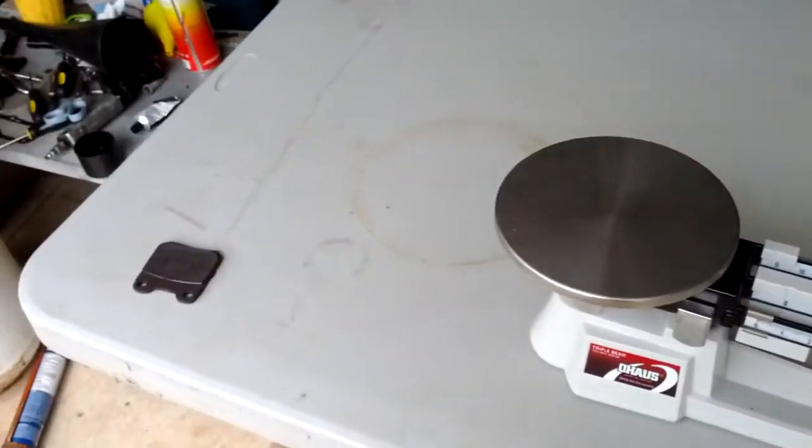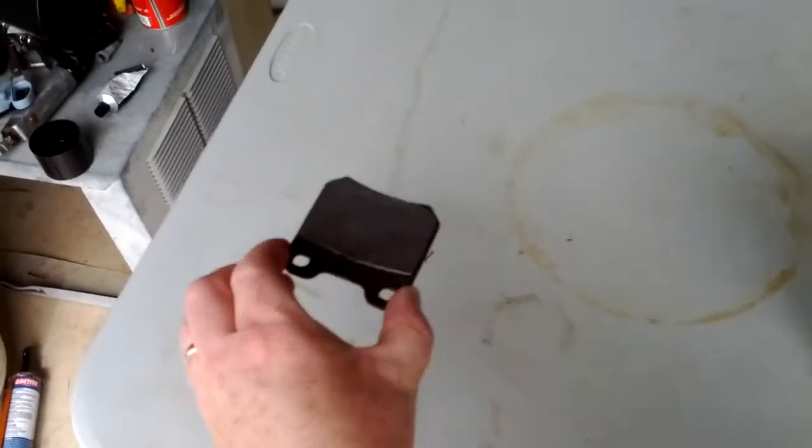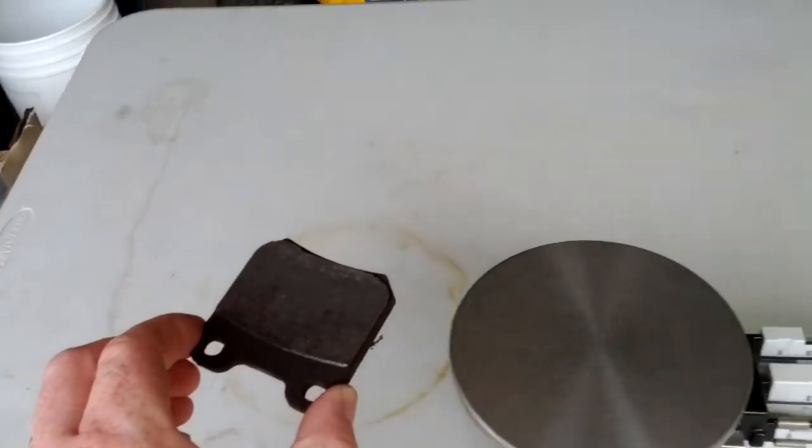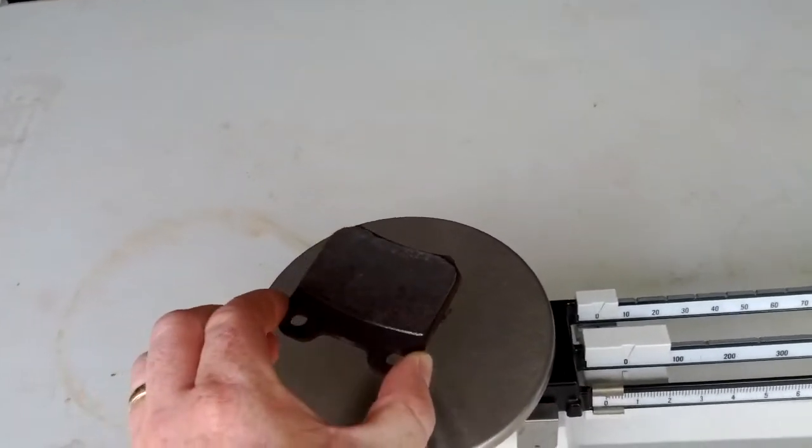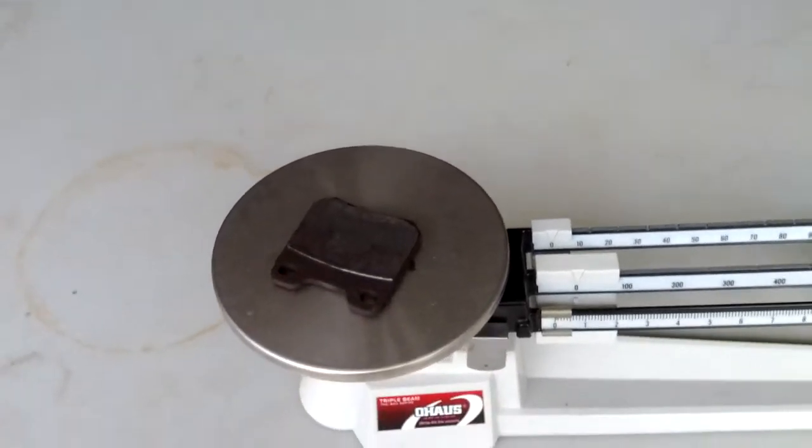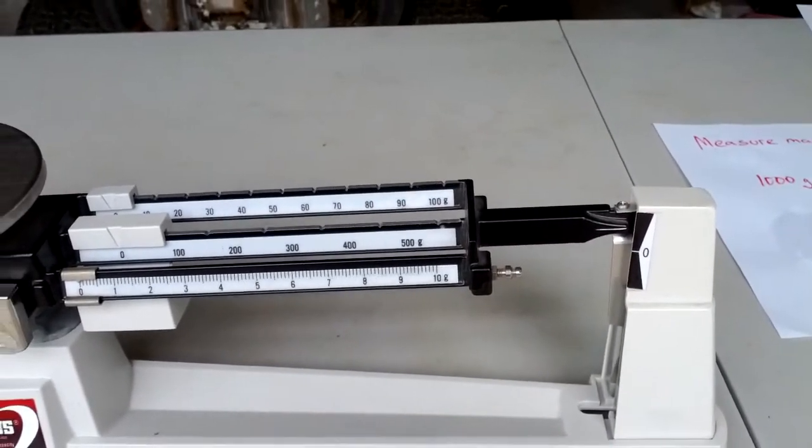To measure mass with a triple beam balance, you need an object that you're going to find the mass of. I have here an old brake pad off of a car. So you put whatever it is, you're going to find the mass of gently on the pan. Again, you don't slam it down. And you see that it pushed the beams all the way up to the top.